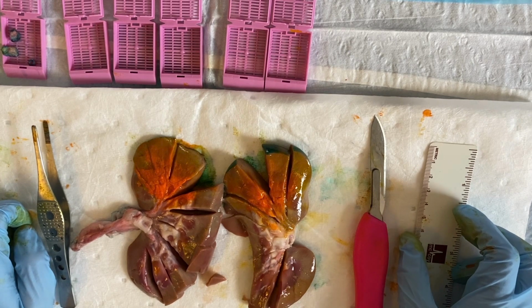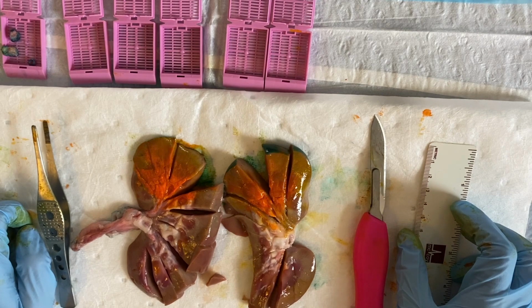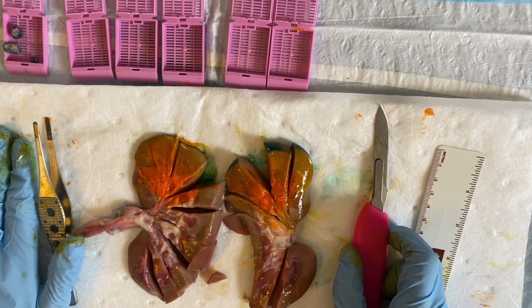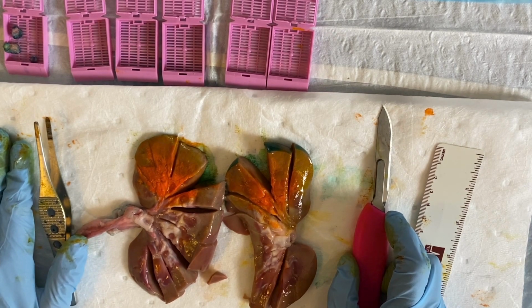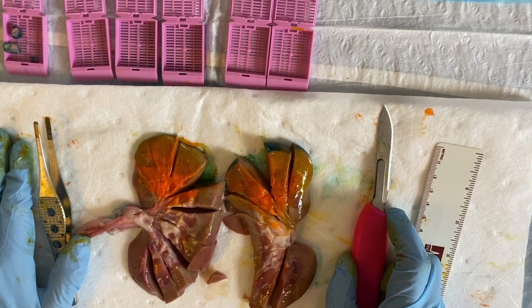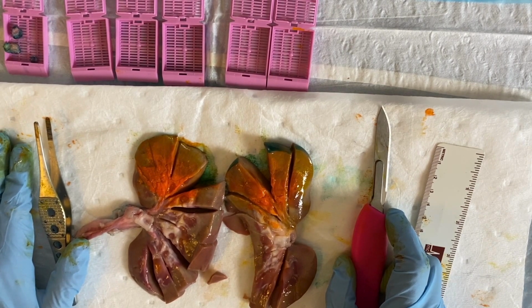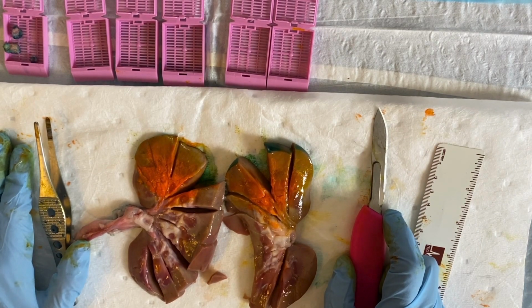Your distance to the outermost surface could include kidney capsule like it does in this case, or it could be perinephric fat or Gerota's fascia, which would be considered the true margin. Important sections to take include, as previously mentioned, tumor to renal sinus fat, tumor to outermost surface, in this case kidney capsule, and tumor to uninvolved.